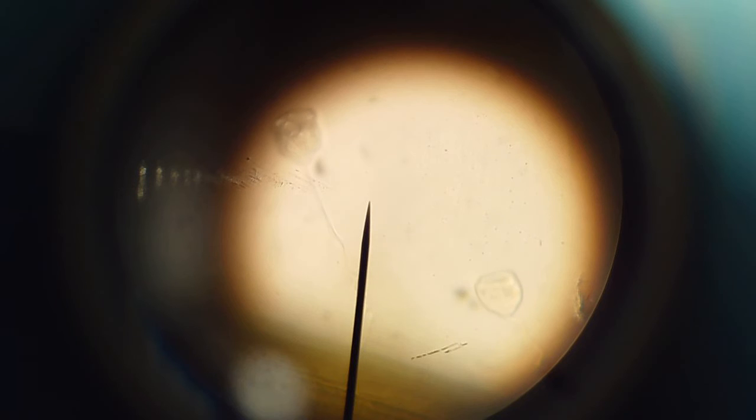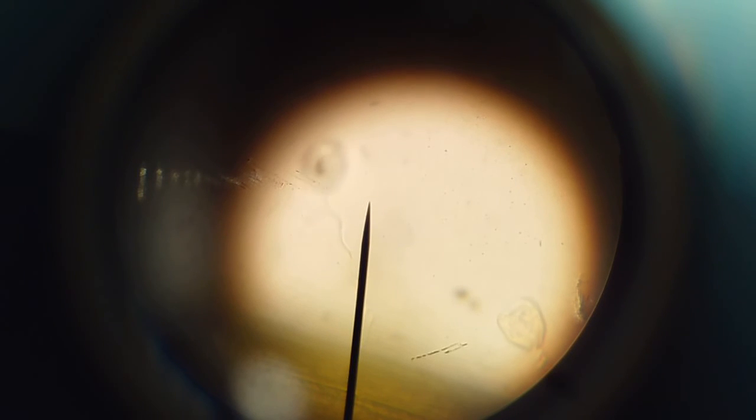Whoa, not that far. There we go. Now we got two of them swimming around, that's nice. That's nice visibility of a vorticella. He springs up, swirling little suction cups on the end. These are really nice examples of protists, and that's all.